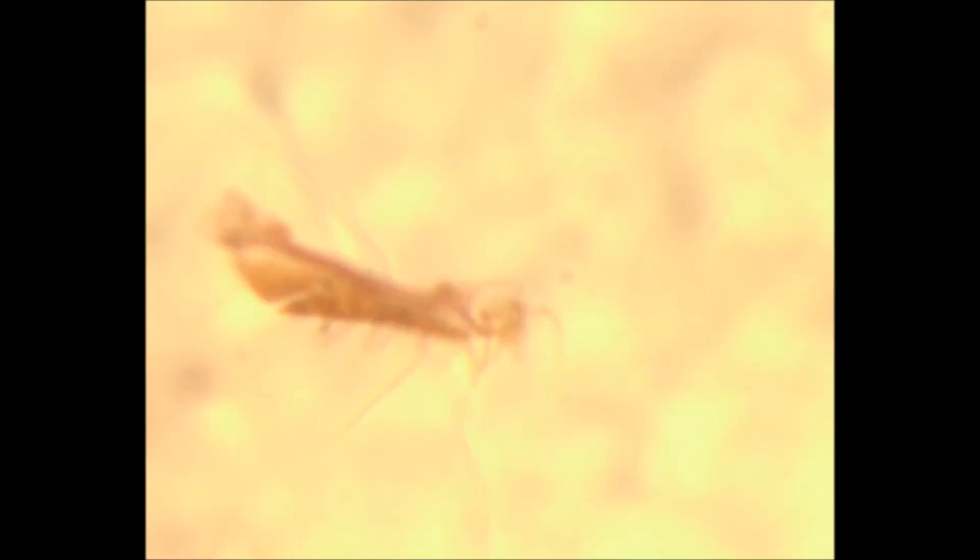So now I'm going to get the cover slip and put that on, and try to keep everything flat, especially that epipharynx. I'll hold the cover slip in the fine forceps, wipe with a kimwipe, slowly lower it onto the tissues. You don't have too much control over what they do right now.